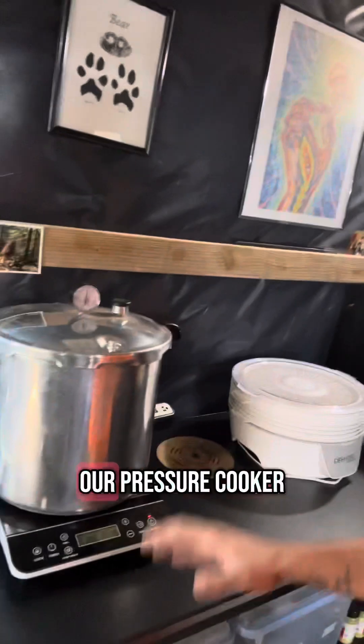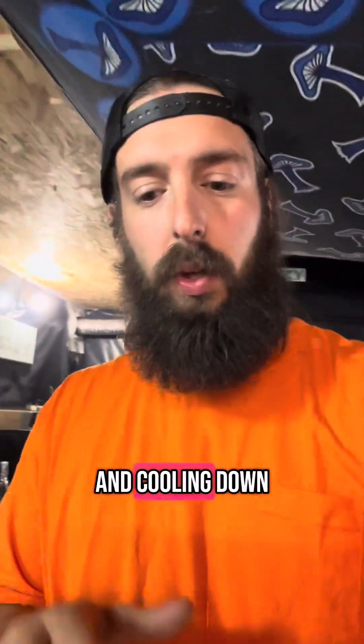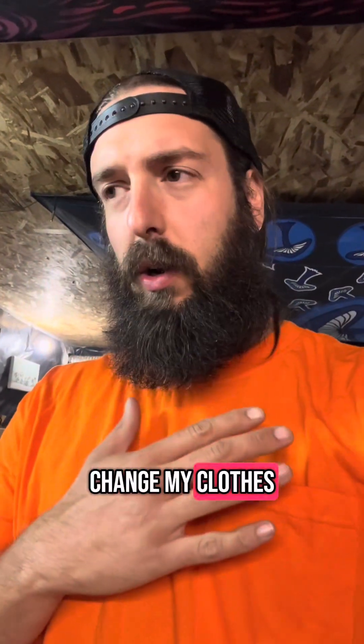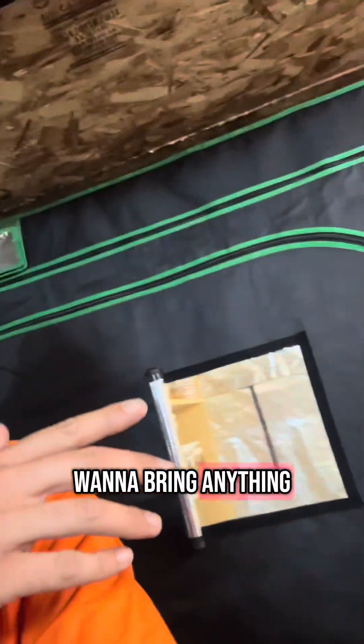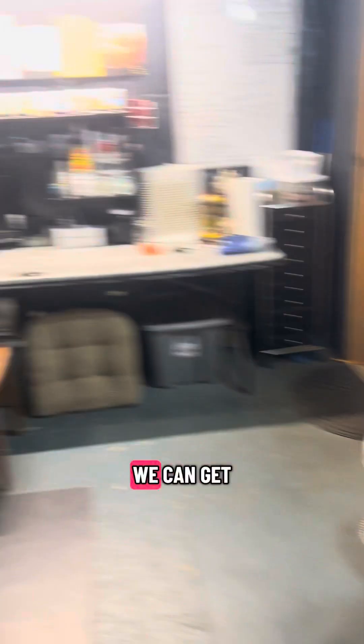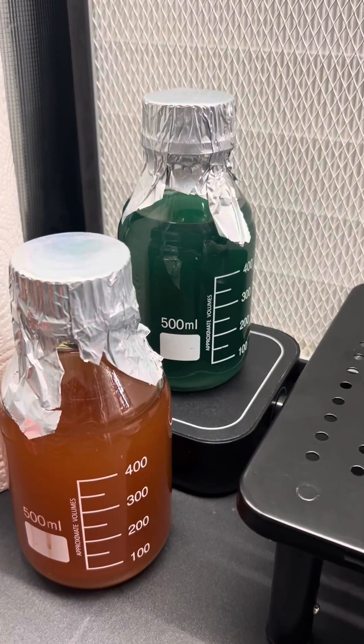It's been 30 minutes and our pressure cooker is depressurizing. While it's doing that and cooling down a little bit, I'm going to take a shower and change my clothes — I've been doing all sorts of stuff today and I don't want to bring anything into the lab. Now that everything is cooled down, we can get our Pyrex bottles into the lab in front of the flow hood.